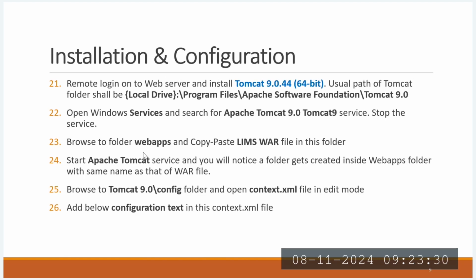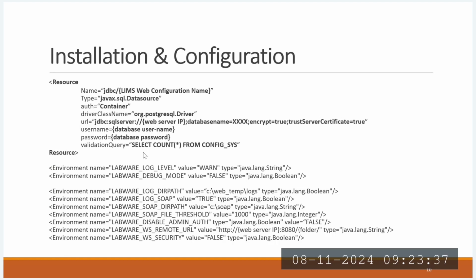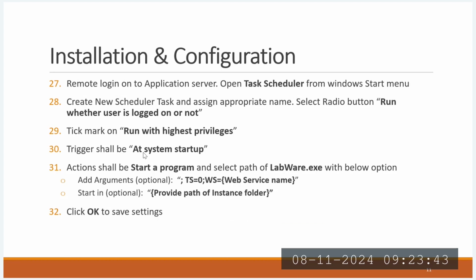Tomcat servers related, remote login for desktop, like database server access, everything. This is somewhat basic information, so I don't want to discuss these. And remote login, how to take the access, like RDP servers control purpose. We will use some of the logics the way the SQL database team recommended.